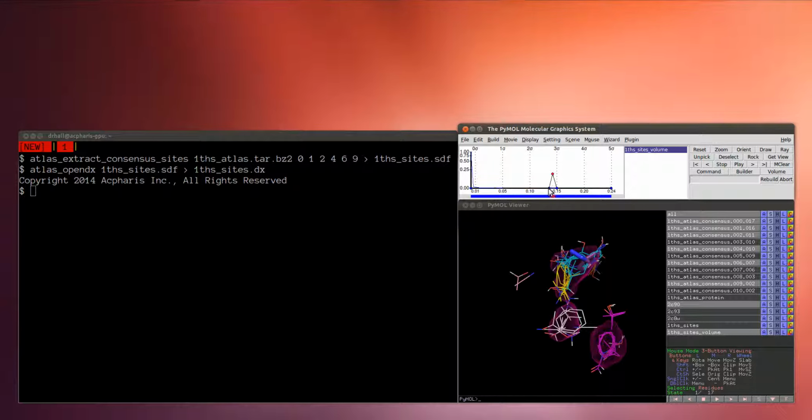We can see this a little bit if I pull this out all the way over here. Now you can more easily see this blue border of low intensity stuff along here, and you can see that gradient really. So let's pull it back over to where it was originally, so it's more like an ISO level.